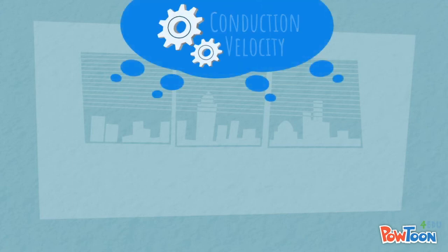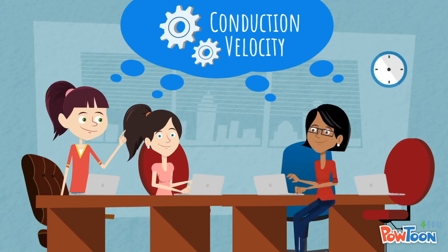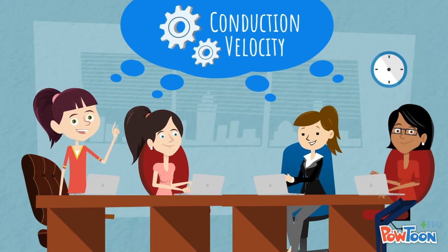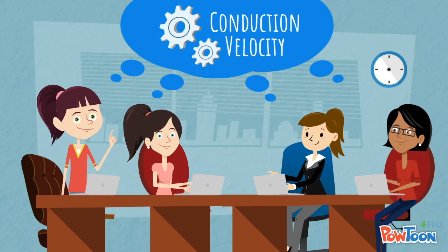Conduction velocity measures how fast an action potential propagates through a nerve. To measure the A-alpha conduction velocity, CAPs were recorded with the negative recording electrode at position D and at position E. The latencies of the two CAPs were then used to calculate the conduction velocity. We repeated this experiment for each temperature condition.